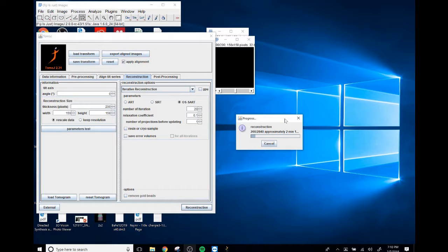It's 7 o'clock on a Wednesday. Not too much going on. So let's see. If we wanted to do 200 iterations, it would be 20 minutes approximately. Maybe a little bit more than that. So I think I'll end up doing something like that for this data set. Kind of depends how my computer's feeling. Sounds like it's feeling a little feisty, so it might be able to do it.